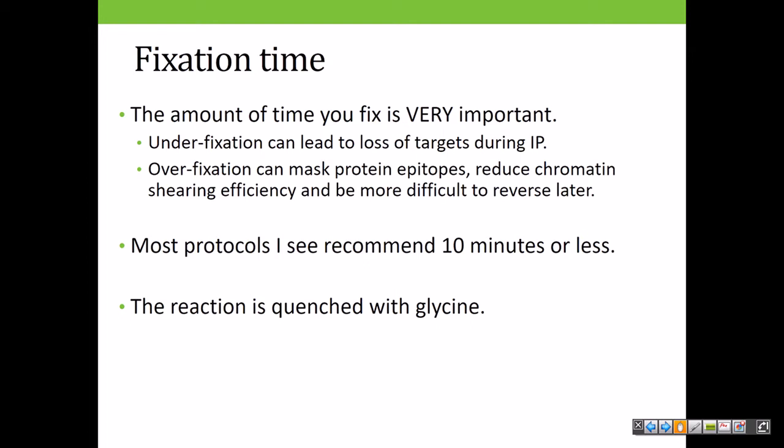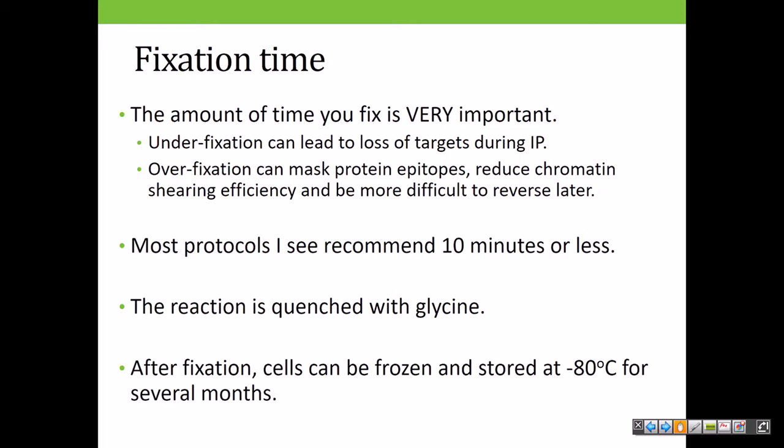And in fact, during the fixation and the quenching, these are all strict time points. After fixation, cells can be frozen, washed, collected, frozen, and stored at minus 80. Or you can just work with them fresh, like fix them and then proceed. I will point out that whatever you decide, be consistent. So if you typically work with frozen cells in the following steps, work with frozen. If you commonly work with fresh, work with fresh. And if you change it, note it in your notebook, because fresh versus frozen can affect the shearing efficiency when you're fragmenting your chromatin.